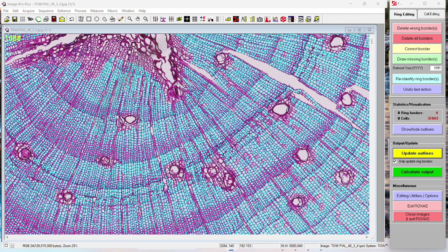It becomes really difficult for ROXAS to understand that. Sometimes it'll have the ring boundaries go off this way and they'll all join, like all of the ring boundaries from these rings will join up over here. It didn't used to do that. I don't know why it does now, or if it messes up anything. I'm assuming it doesn't, but sometimes it doesn't understand even when you draw it perfectly that is where it needs to go, and it'll get mad.